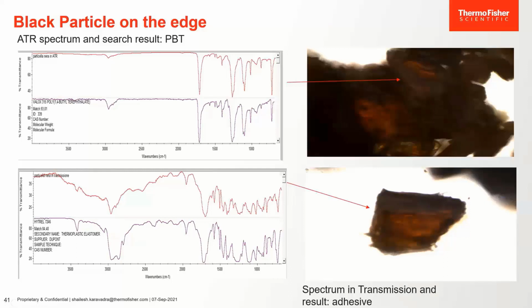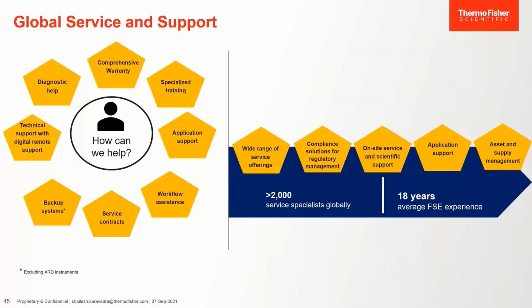This way of utilizing both the techniques and switching the mode very quickly from ATR to transmission gives you a very comprehensive identification of particles, which you cannot get if you use a single ATR technique.